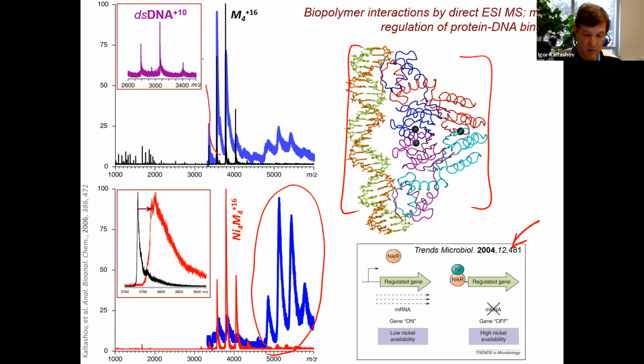In this case, the most abundant signal is still protein, right? Unbound protein. There is a little bit of interaction with DNA, but not as significant. Unfortunately, we cannot attach a number to it, right? We cannot quantitate it using mass spectrometry.